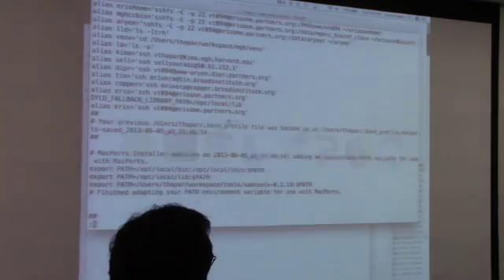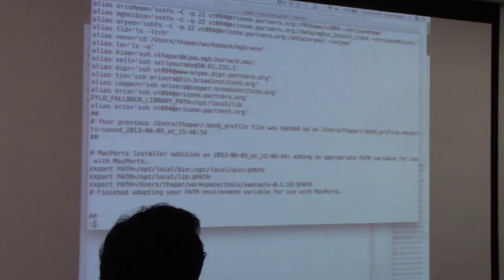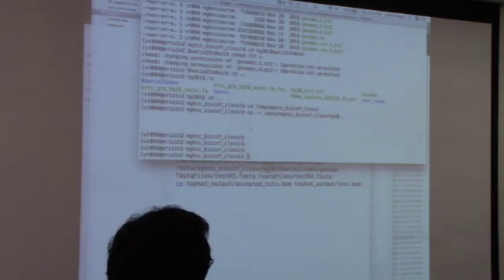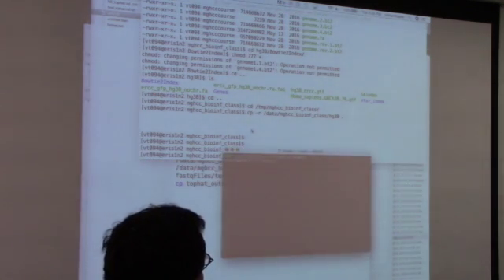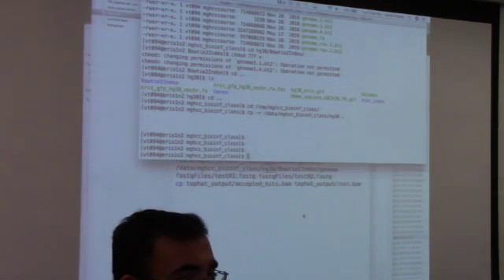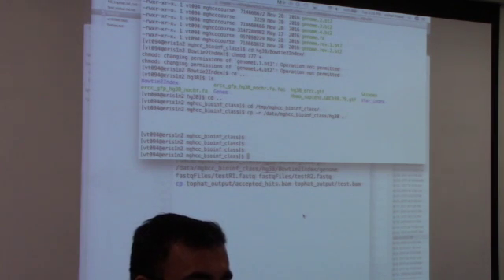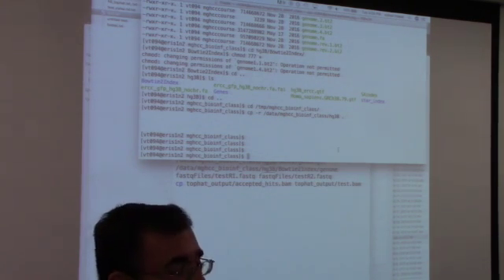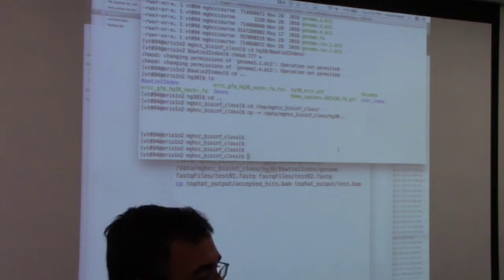And then you can open a new server and boom, every time you open a new window, all you have to do now is type the alias or lld, and it's going to show you whatever directory or command alias you just typed. Okay? Did you guys get it? Do you have to close it before you open a new window? Yeah, just close it, open a new window, and it'll work.